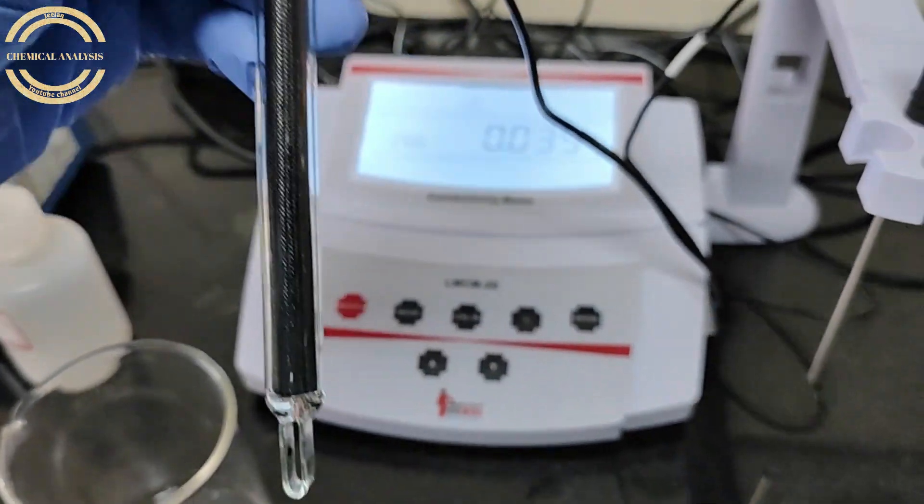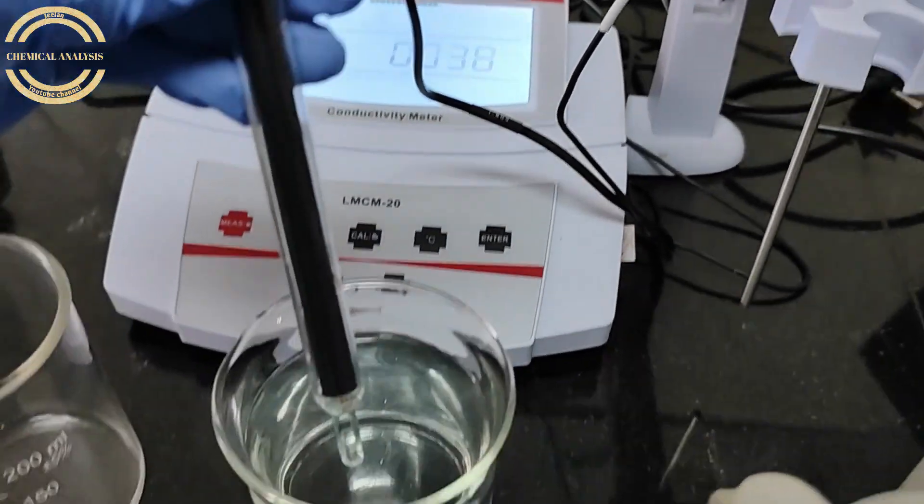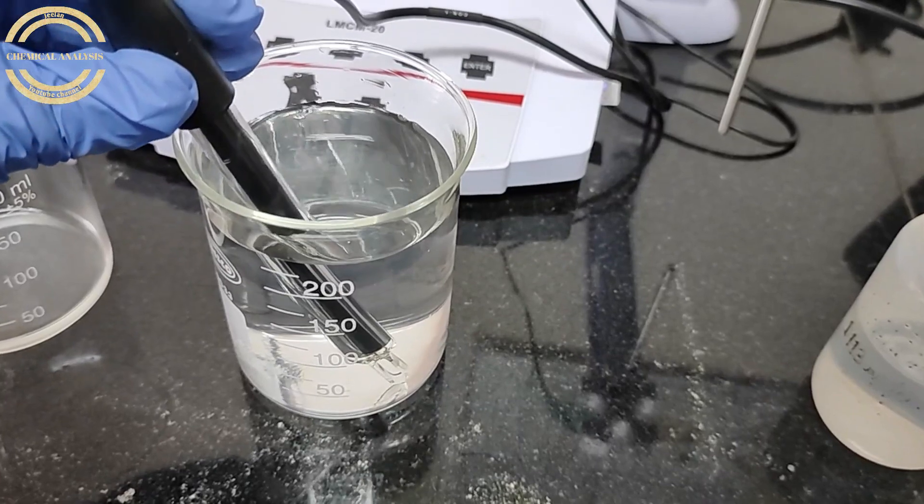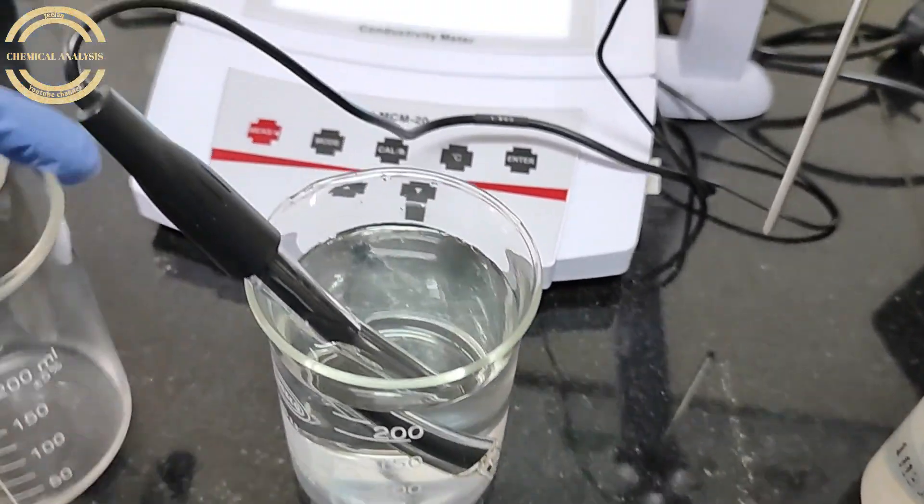Put the electrode into the sample and check the reading. Now the sample reading is shown. The conductivity unit is microsiemens per centimeter.